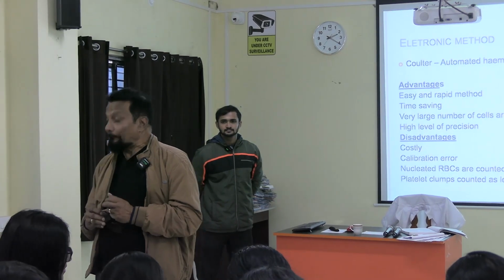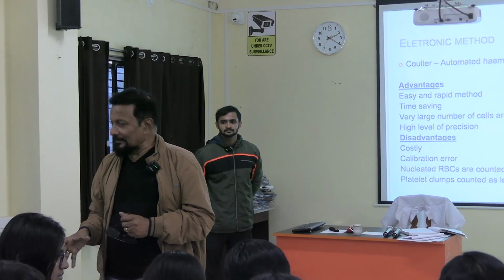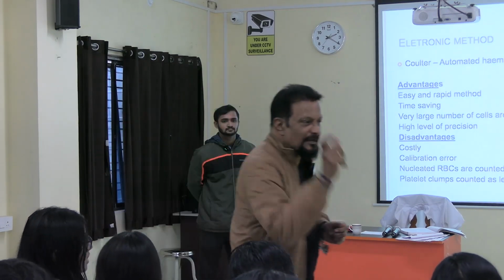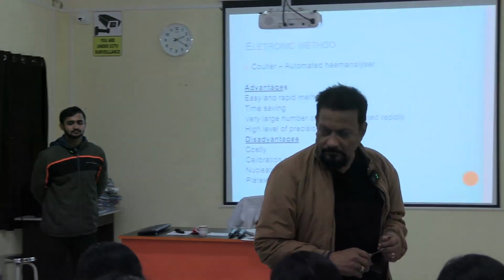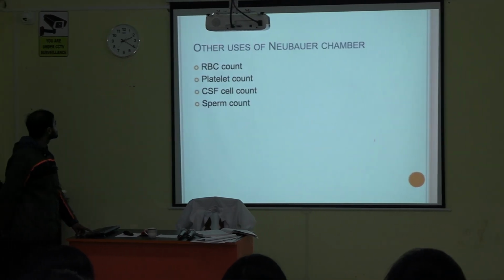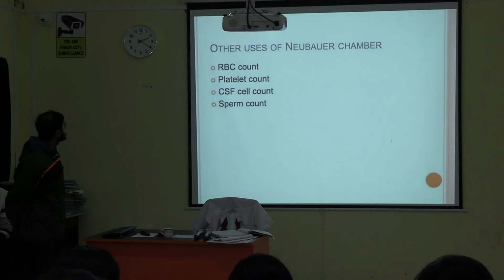I told you repeatedly in practical class and in theory class, whenever you tell a value, please mention the unit. See the concept, that's why I asked. What are the other uses of the Neubauer chamber?